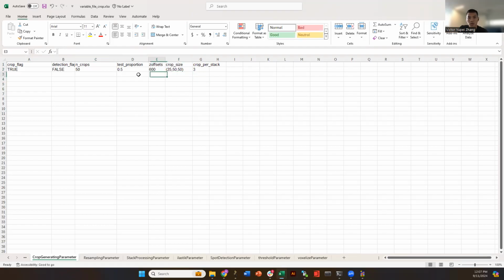Okay. So you probably want to have a lot more images. Maybe they can be smaller, but a lot more, so that you don't miss weird positions, weird types of cells in your data. So for your specific case, I would rerun this and generate more crops if you feel like the test or the training dataset does not represent well your true dataset.